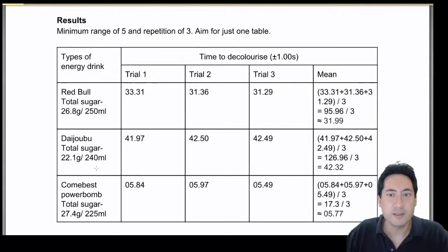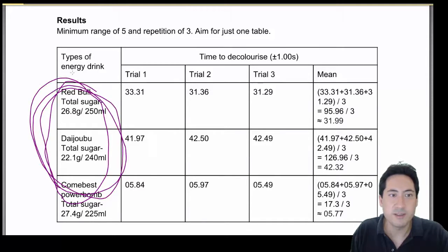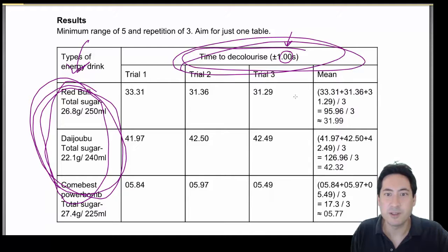You've got discontinuous data here. Biology students love discontinuous data, and the physics. If you're either doing biology and chem or physics and chem, and it's really quite obvious all the time actually. So these are biology students. So time to decolorize. How did you get that? Go check that out. Go ask one of the physics students on what's the standard for stopwatch.